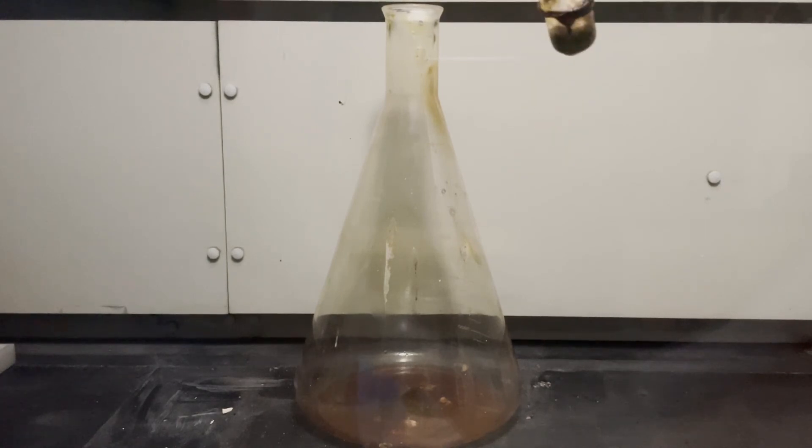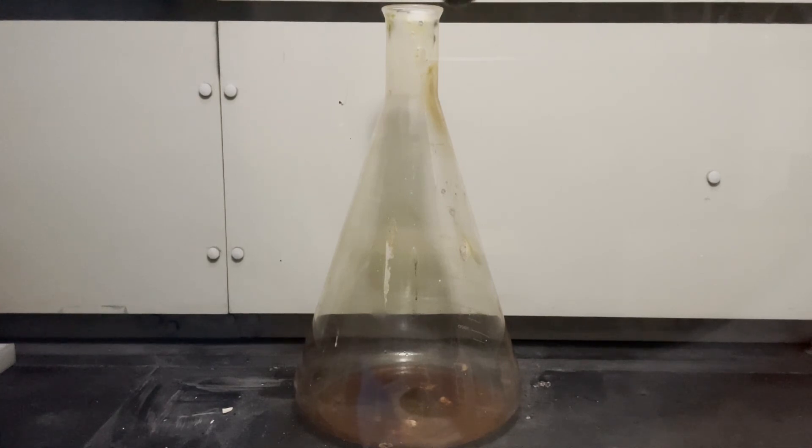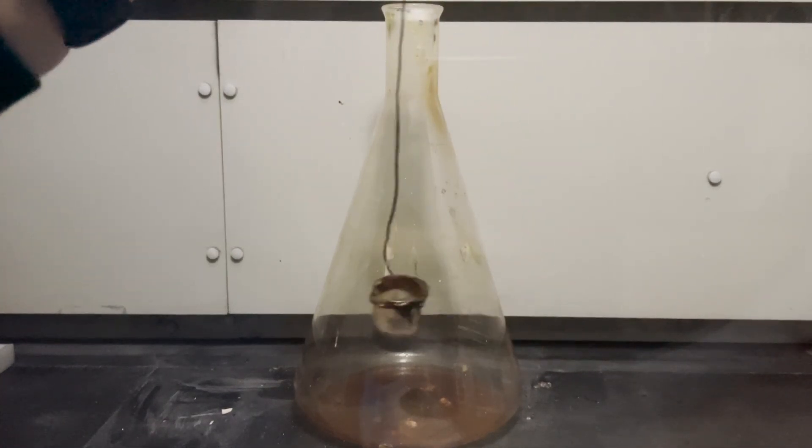What we're left with doesn't look very appetizing. So you can understand that this isn't how we actually make most of the sodium chloride that goes into your food. But it's still a very fun demo to run.